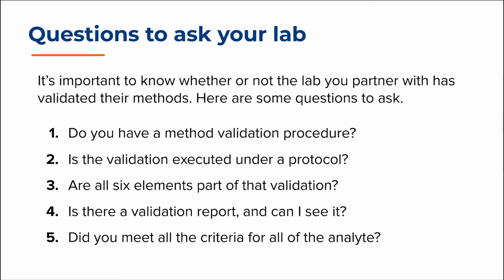Hopefully this introduction to the figures of merit measured during validation has provided some insight into the work being done by your lab to ensure their results are accurate, precise, and true. What I would like to leave you with is a small list of questions that you can use to initiate a conversation with your lab regarding method validation. These questions will probe how complete, compliant, and correct the validations are.